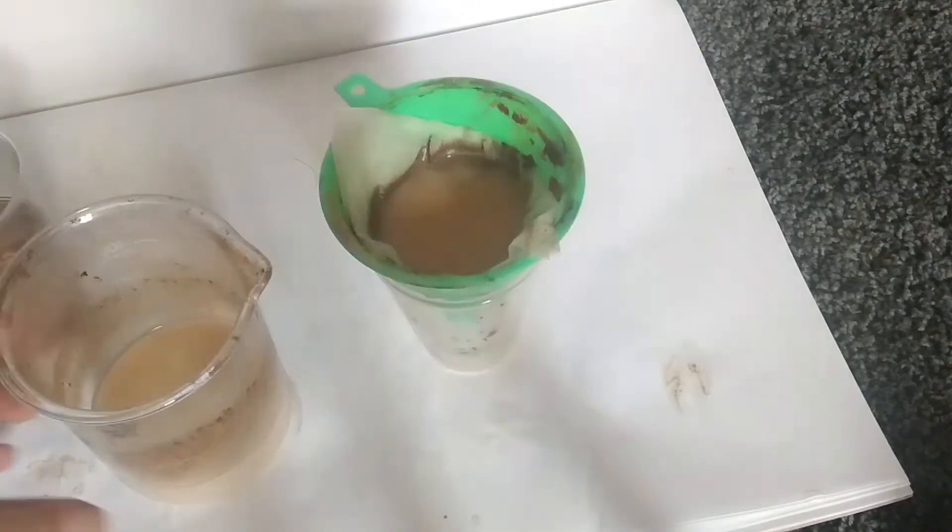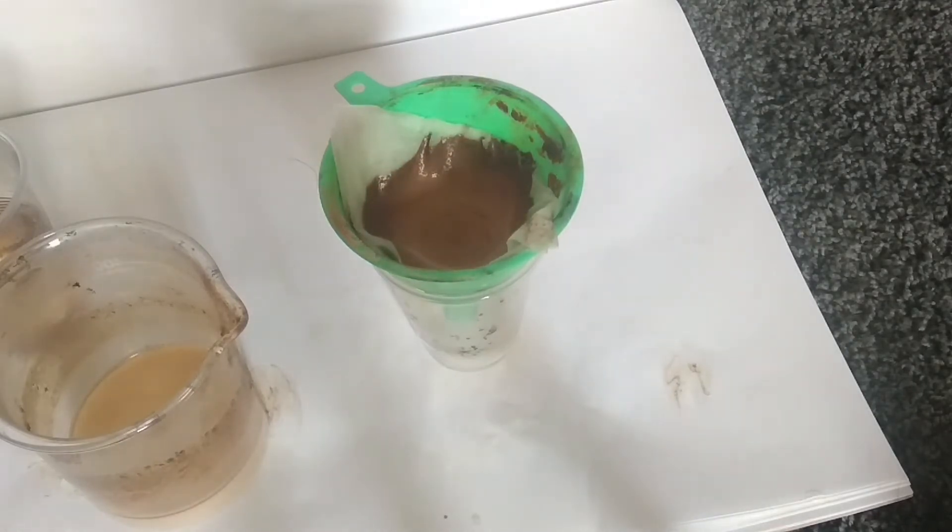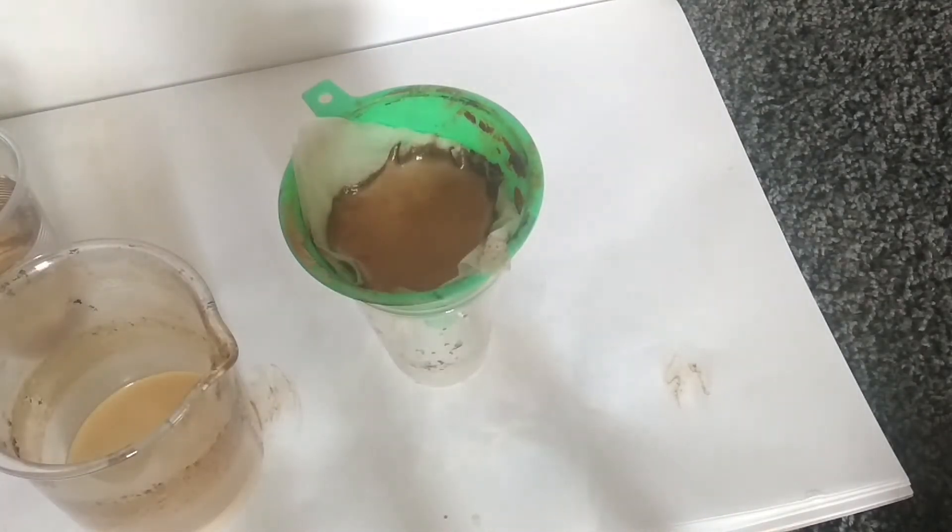I've actually had another separate run going on in the background, and it turns out that the manganese dioxide from that run was actually much blacker than this one. I have no idea why this is — probably something to do with manganese trioxide forming, which is kind of brownish.